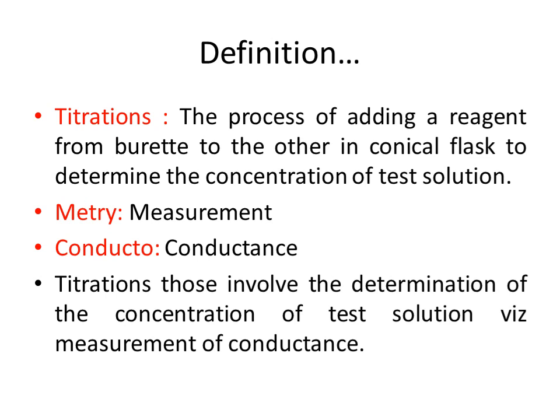So what do we mean by metry? Measurement. Conducto stands for conductance. So titrations in which we measure the conductance. Is that the thing we have to determine? The answer is no. What we have to determine is the concentration. How do you determine concentration by conductance? Let's see.